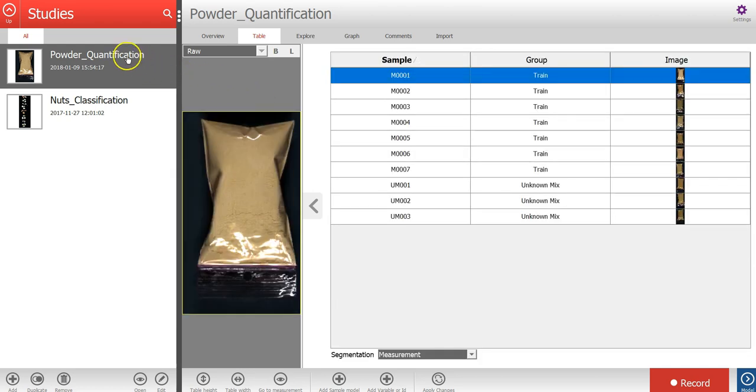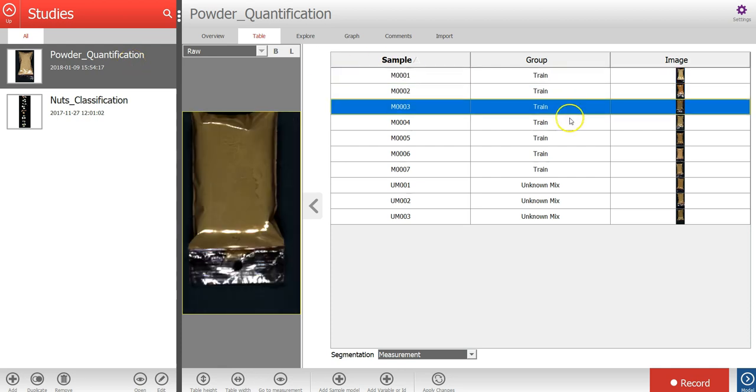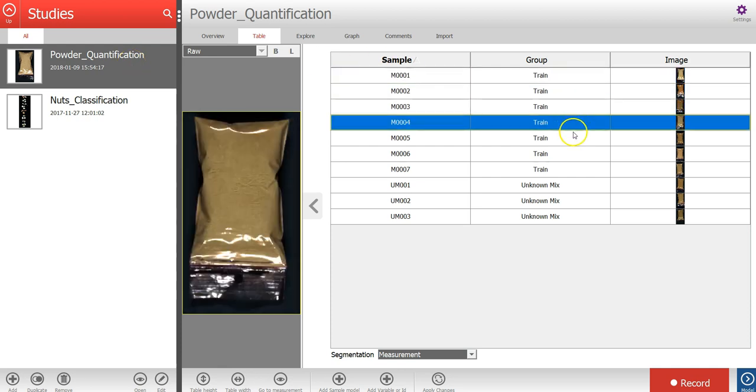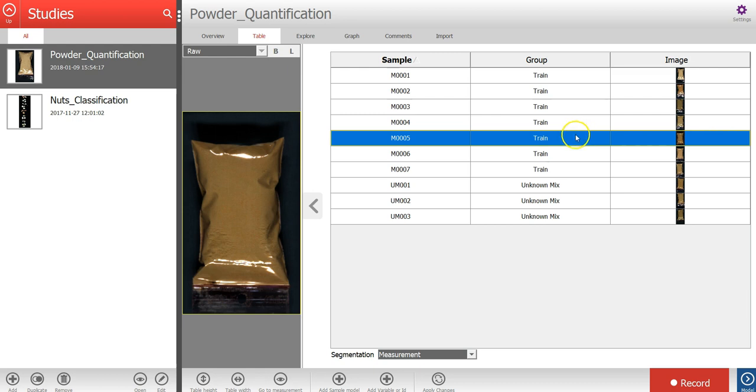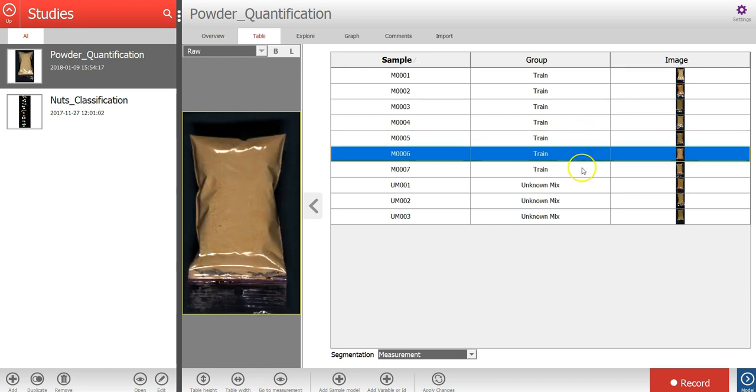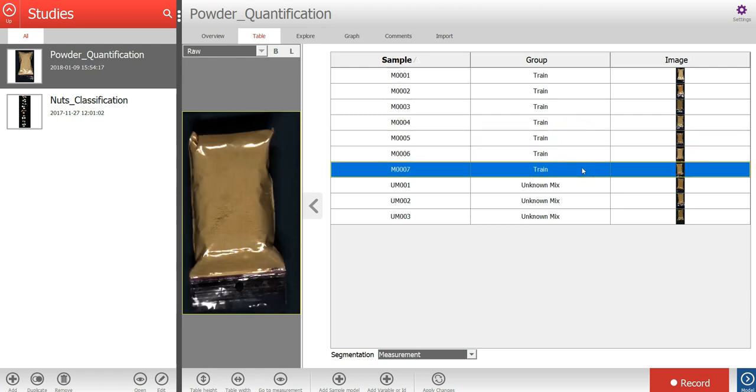A study called powder quantification has now been created that includes images of plastic bags containing a mix of powders. Let's open this study.